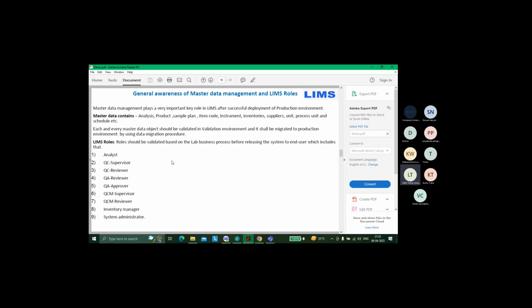But why don't we create one single role? Why are there so many roles? Can anyone answer me? This is one important question. Why roles? Why such segregation? To have different privileges. Why do we need different privileges?